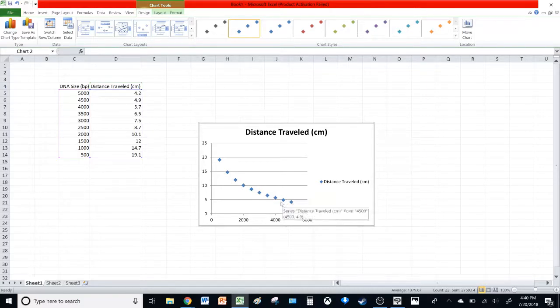And I feel that some people take a different route from what I will use. So I find it easier, instead of using the exponential curve, to transform this into a linear curve so that it will be easier for you to manipulate and extrapolate data from.